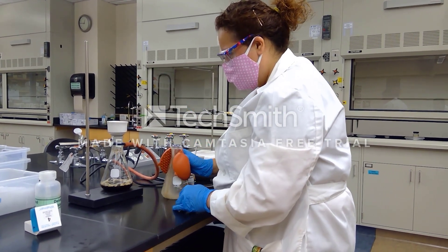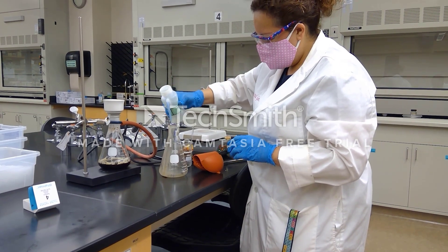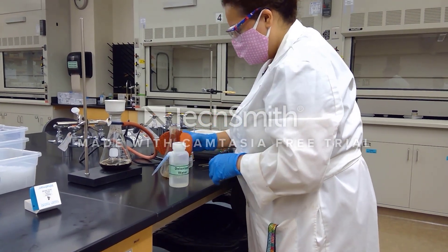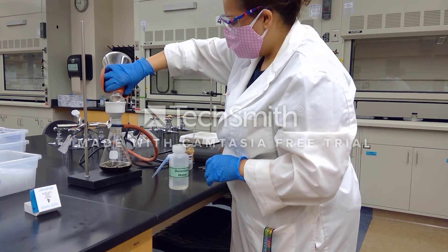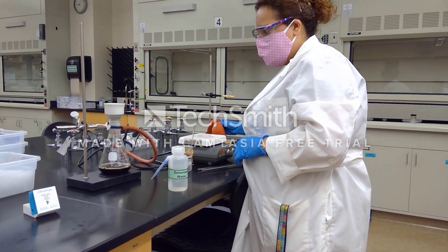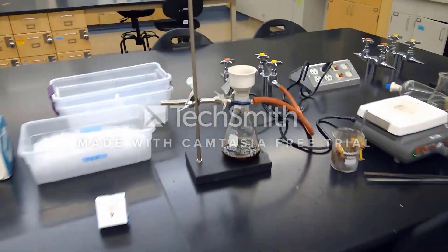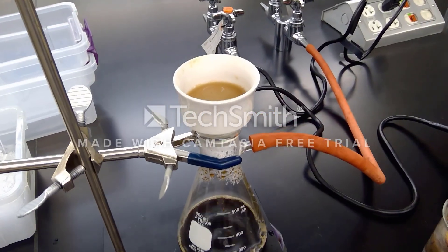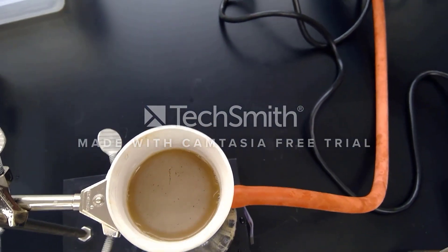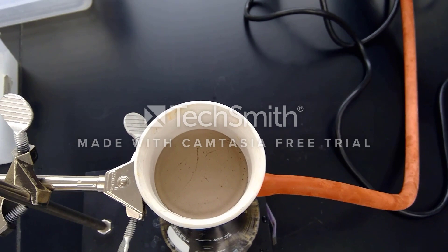I'm going to go ahead and rinse my container here with a little bit of deionized water just to make sure we maximize our solid-liquid extraction. That looks very good. All of that dark stuff at the top of the filter is your calcium carbonate along with some tannins that have been extracted from the solution.